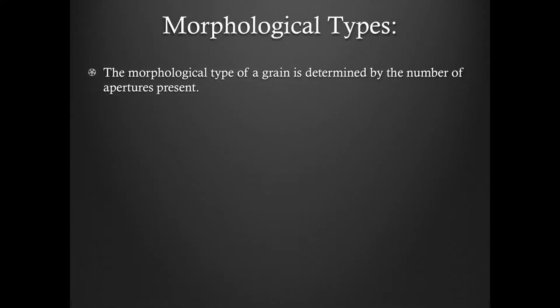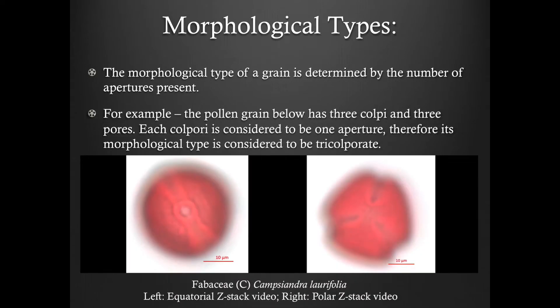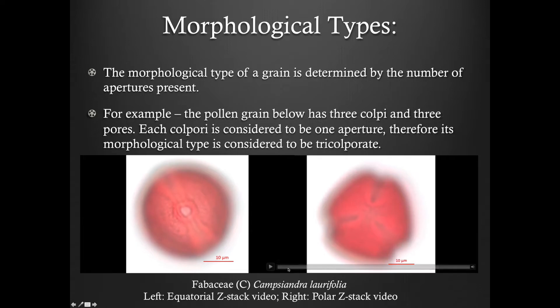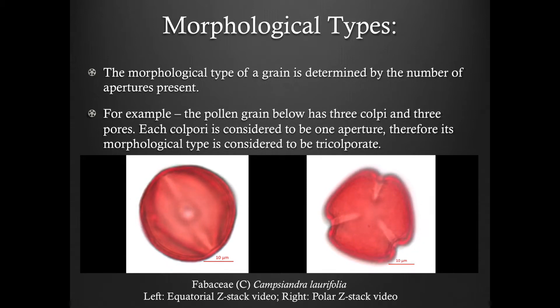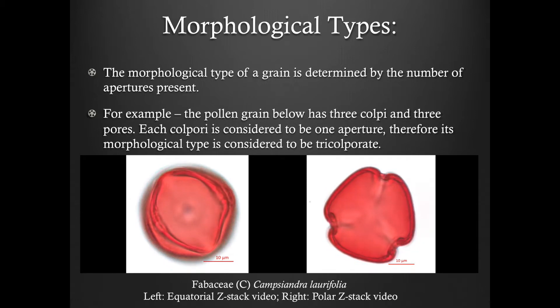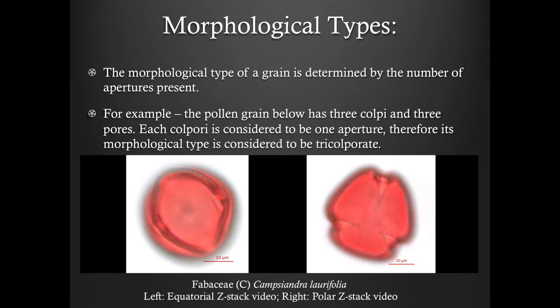The morphological type of a grain is determined by the number of apertures present on that grain. Let's look at the ZStack videos below for an example. The pollen grains shown have three colpi and three pores. Each colporate is considered to be one aperture, therefore its morphological type is considered to be tricolporate.